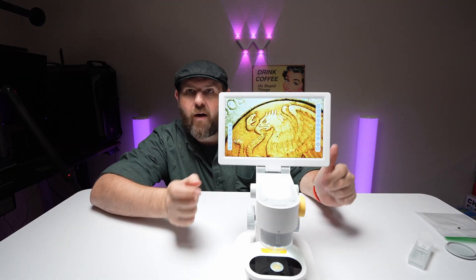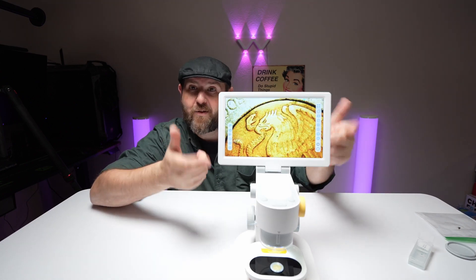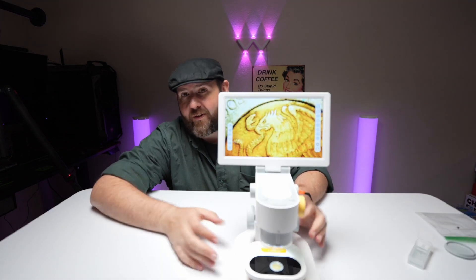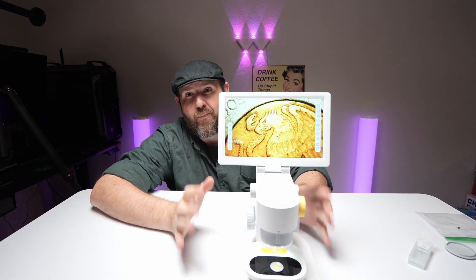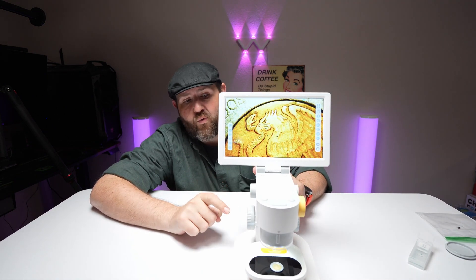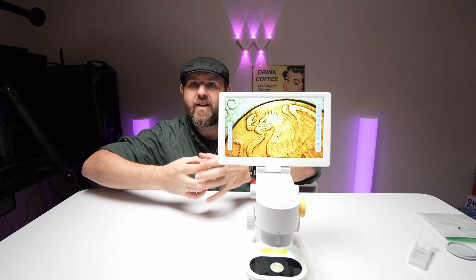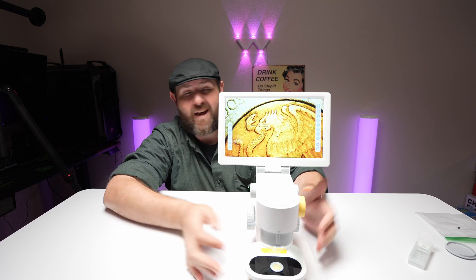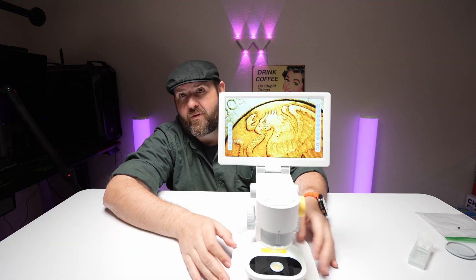Anyway, that's my quick overview of this microscope. I think it works really well — I really like this one. I like that the screen is really large, you can connect it to your computer and get the images and files off of it pretty easily, and it does have a pretty nice magnification. I do wish that it would go just a little bit higher so we can get more in focus, but besides that it works great. You can see some really small things and it's pretty cool.